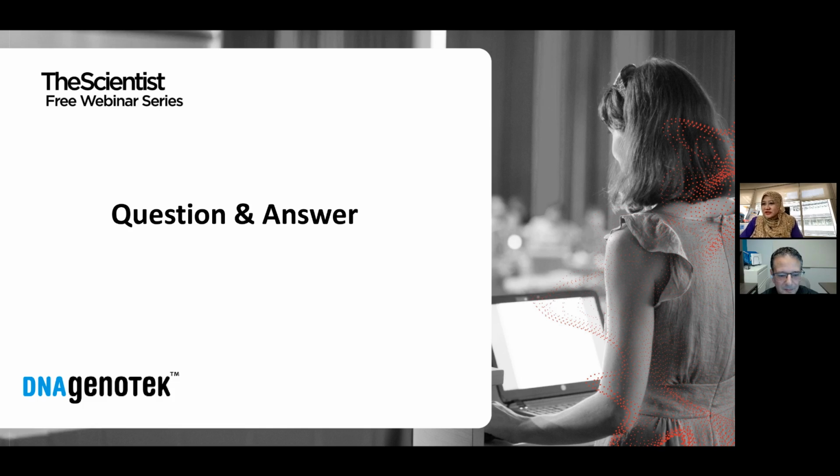Thank you, Latifa, for the question. From our experience, using saliva and saliva swab, we are satisfied with both products. We can take the DNA from the saliva and saliva swab, and we can run the HLA typing either using the SSO or NGS. That's my answer for the question.